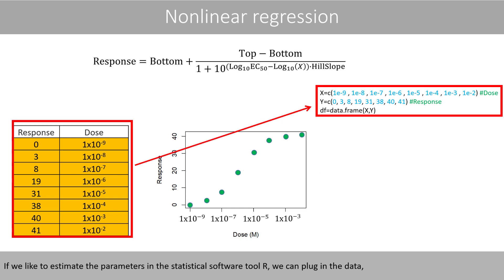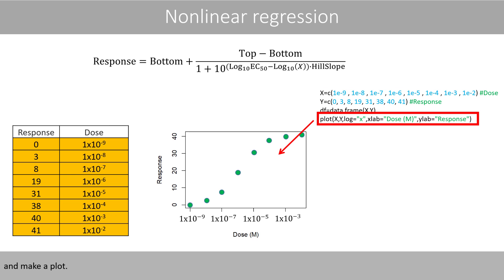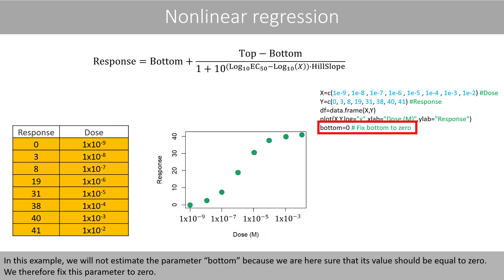If we like to estimate the parameters in the statistical software tool R, we can plug in the data and make a plot. In this example, we will not estimate the parameter bottom because we are here sure that its value should be equal to zero. We therefore fix this parameter to zero.